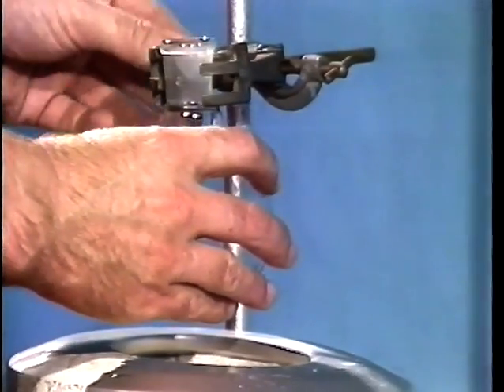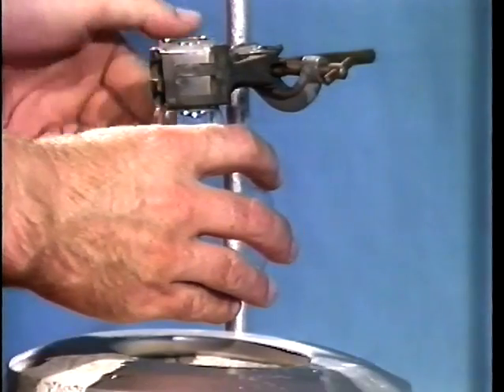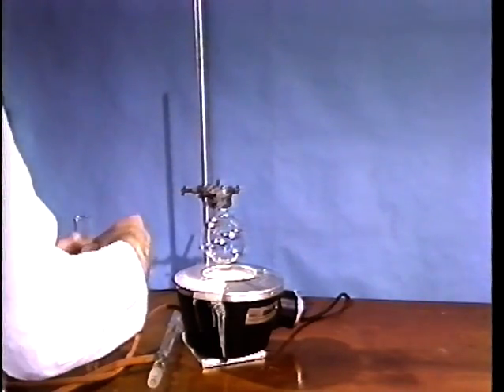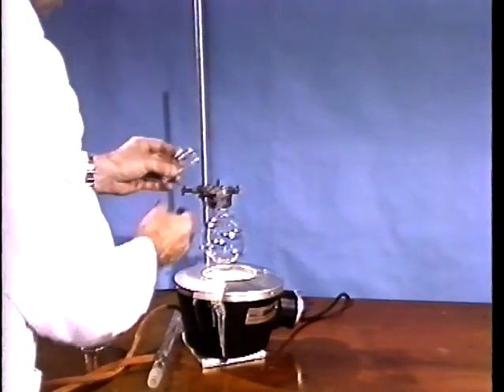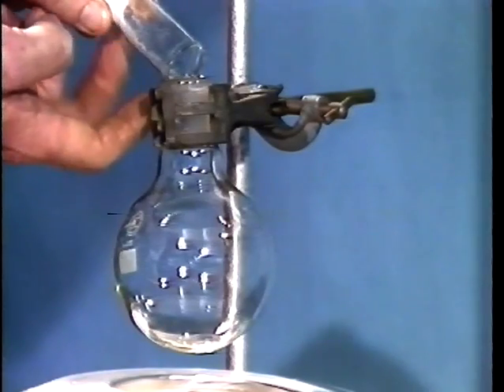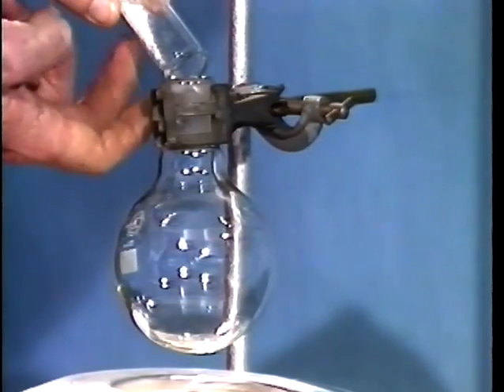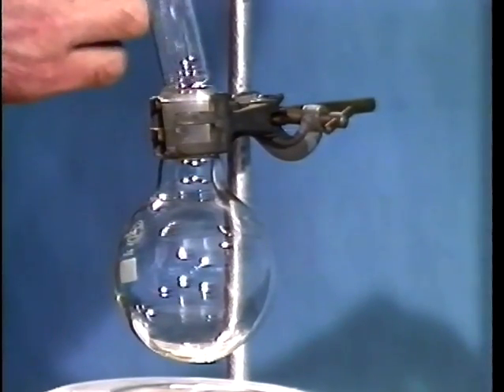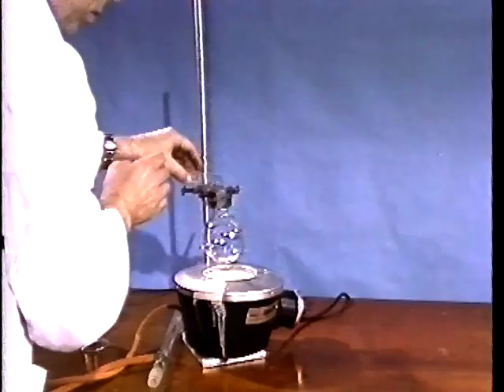In order to recrystallize the bulk of your sample, set up the recrystallization apparatus as before and put the solid into the flask. Again, this requires some expertise, and you'd probably be better to use a funnel to put the solid into the flask.